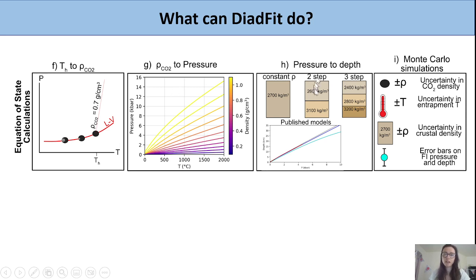Once you have that pressure, you can convert it to depth in the crust using different crustal density profiles. You can use a constant density, a two-step density, a three-step density profile, or a number of published density-depth models from different tectonic settings.